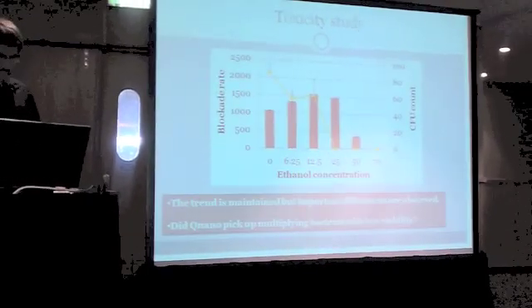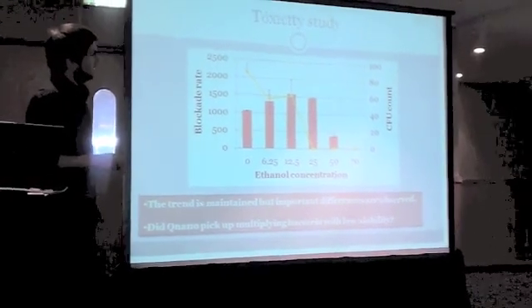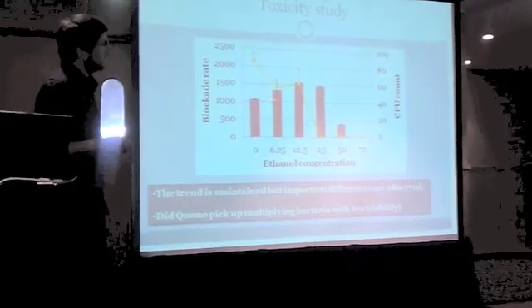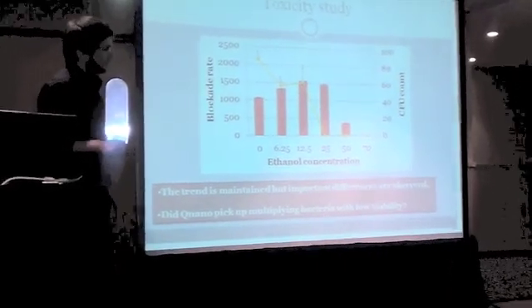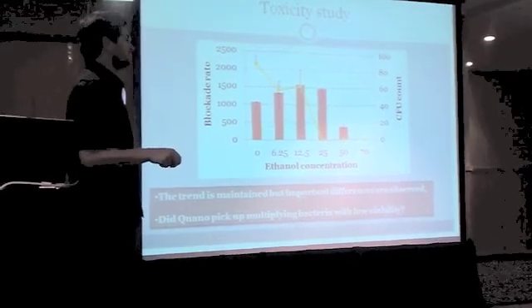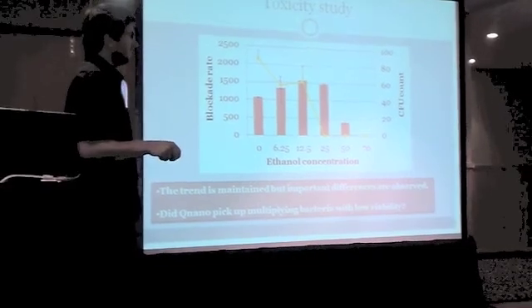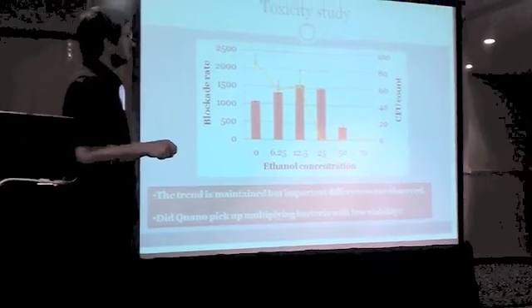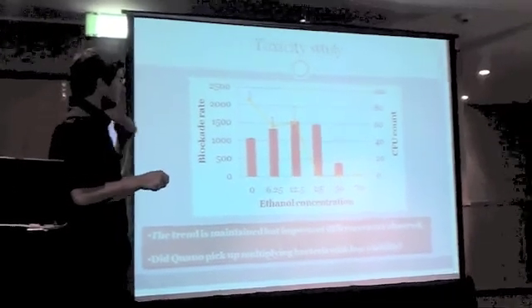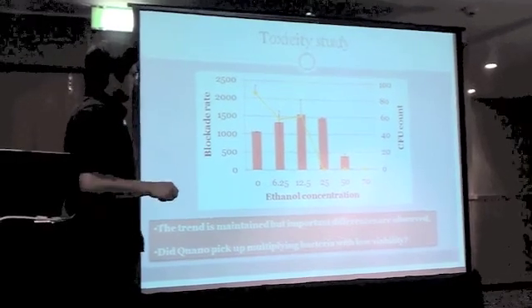This is brilliant. Then we compared it to plating, the old-boring technique, and plating is shown here in yellow, and the qNano results are shown here in red. So if you want to be happy, you only look at the end, and you see that roughly the qNano and the plating technique gave us the same results, essentially, more or less. Then in the middle bit, it kind of agrees. And there are two main points of difference, at 0% ethanol and 25% ethanol.